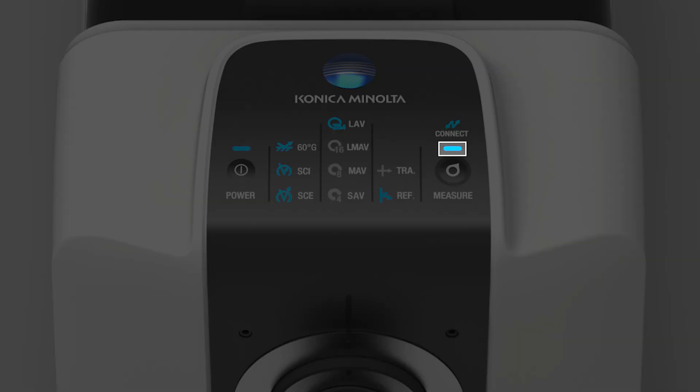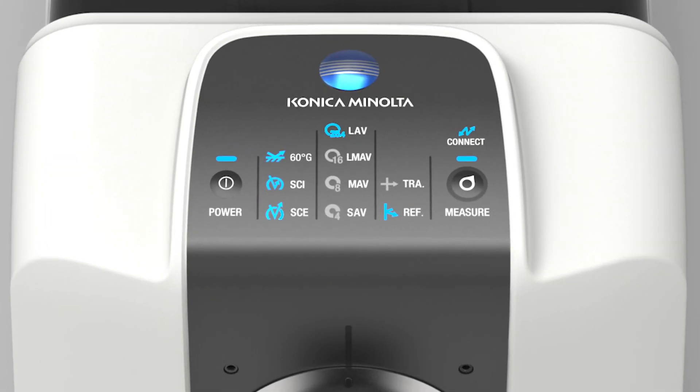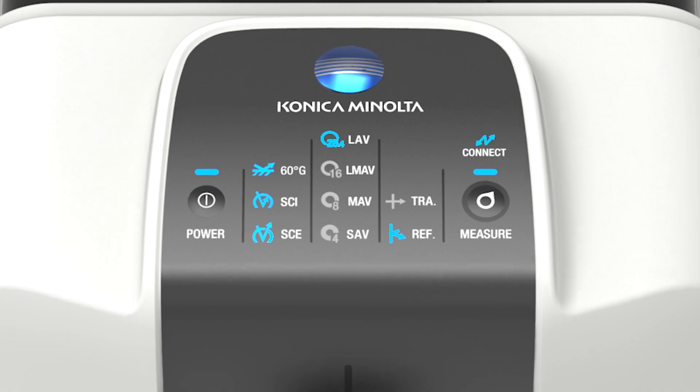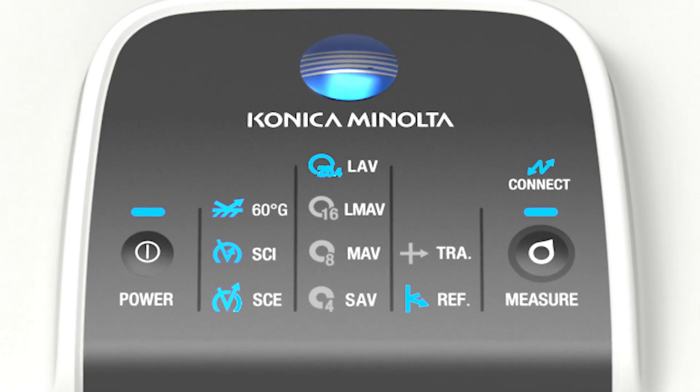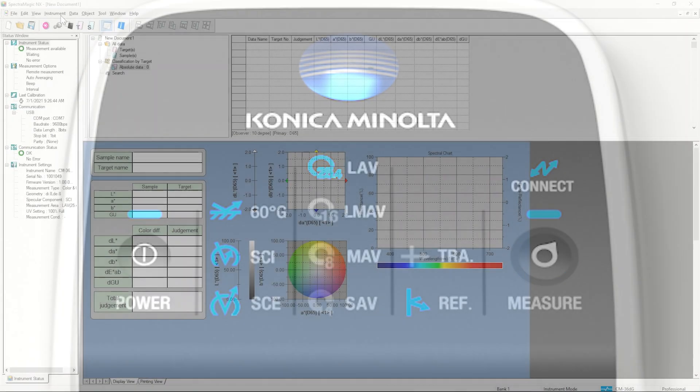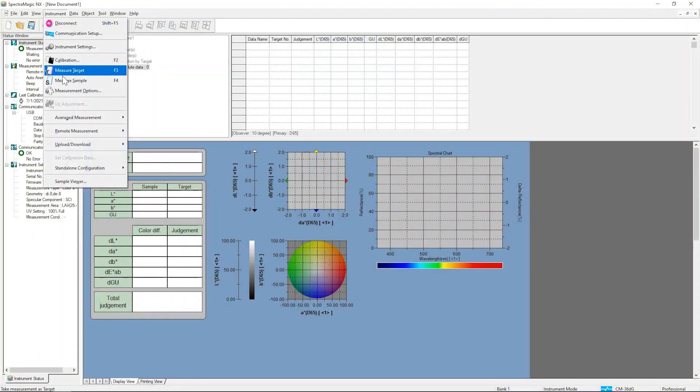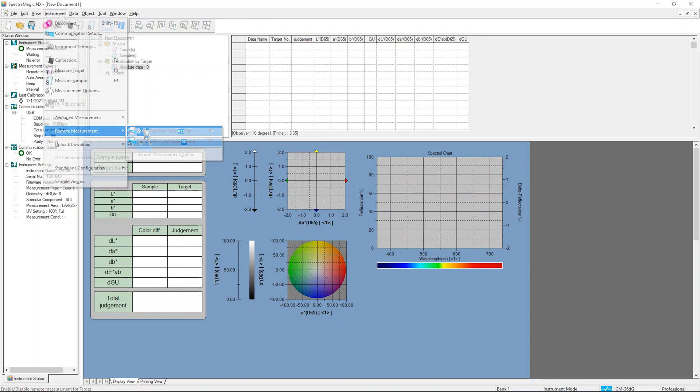You can physically press the Measure button on the instrument shown here or use software to activate the Measure button electronically without ever touching the instrument.